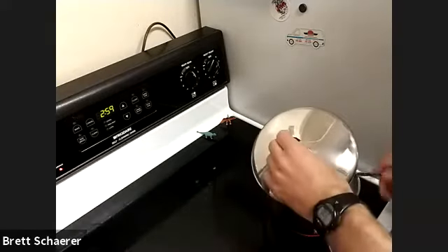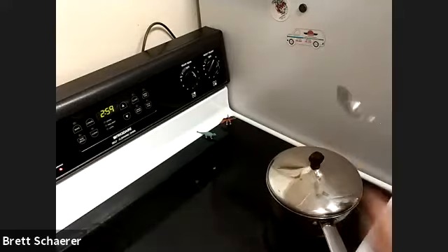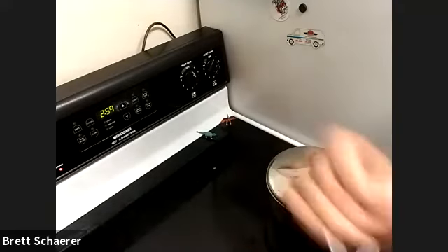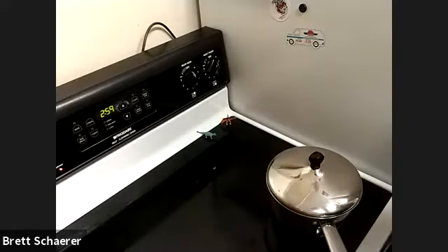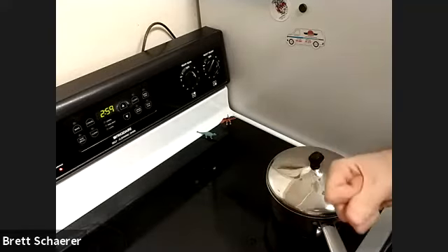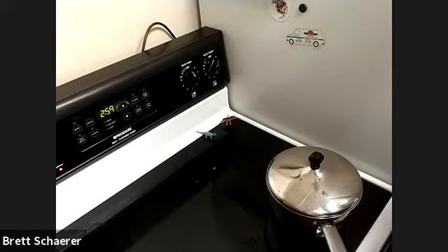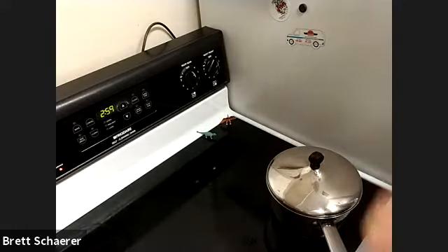Okay. So I'm going to keep stirring that. You don't need to keep watching me as I stir it. After your salt is dissolved, you're going to want to let it sit for quite a while until this solution gets to room temperature. So we want to make sure that temperature is not a confounding variable in this experiment. So I'm going to take this off the stove and let it sit for a while.